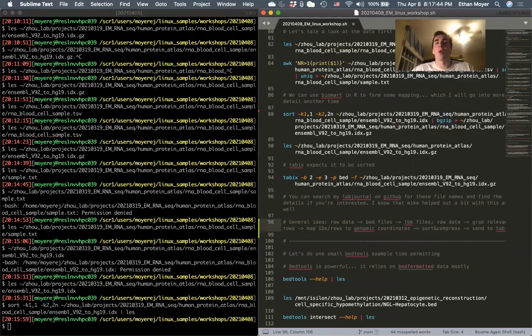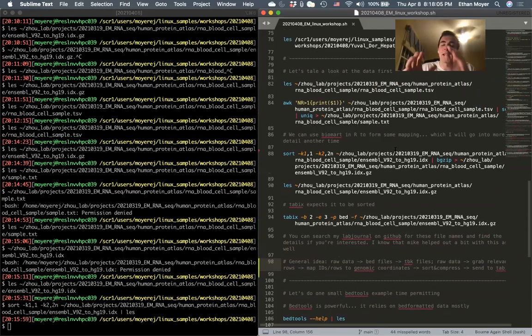Although you probably won't be creating TBK files for RNA-seq data, you might be creating it for other types of data. And luckily for all the data that Wanding downloaded, he automated this process. But it's good to understand how tbmate works, and doing this process allows you to understand it.